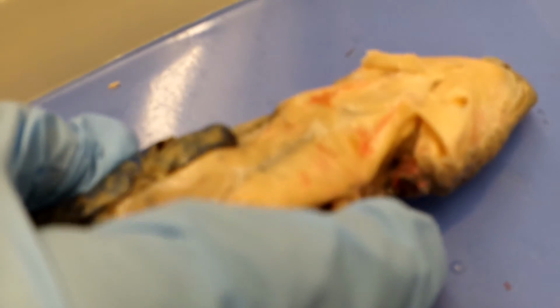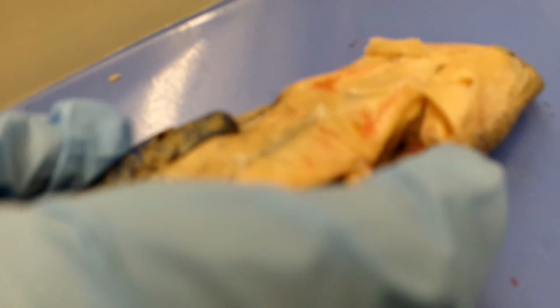The next muscle is the coracobrachialis, which is this muscle. Its origin is the coracoid, its insertion is the humerus, and it's homologous to the pectoral fin adductors in the shark.